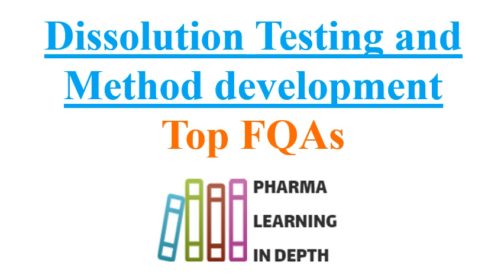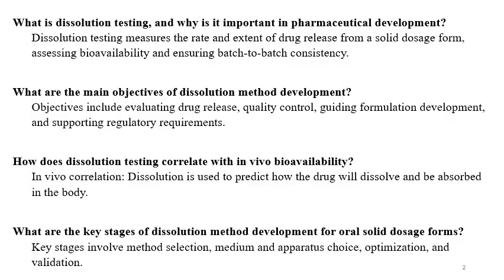The regulatory authorities for these markets are always asking for the dissolution method development and testing. Many queries arise on this topic, and that's why this is a favorite topic for the interviewers. So let's start with the questions and answers quickly.